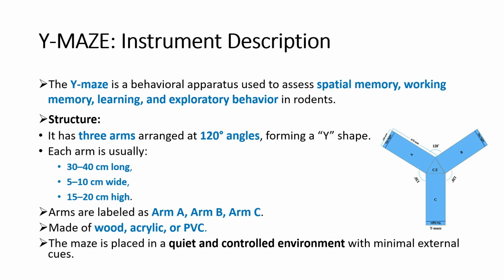In instrument descriptions, Y maze is a behavioral apparatus used to assess spatial memory. Spatial memory means it is related to place, working memory, and learning and exploratory behaviors in rodents. Exploratory behaviors means new place, explore the new area.